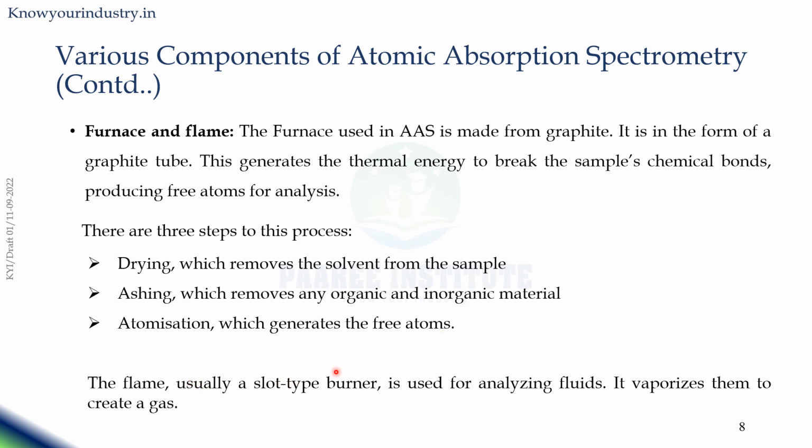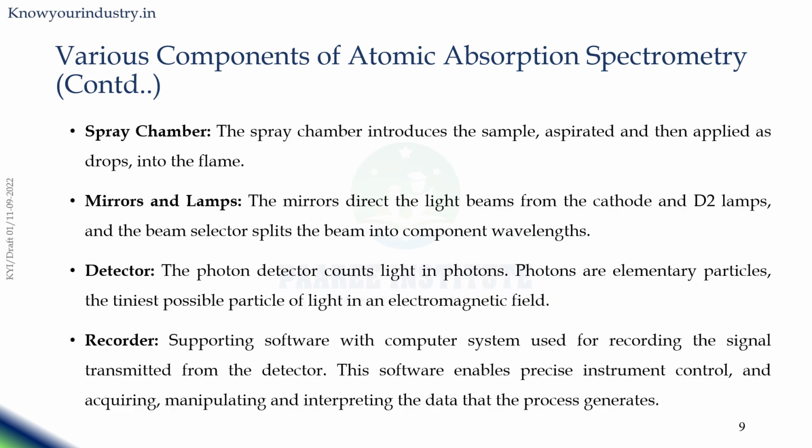The flame, usually a slot type burner, is used for analyzing fluids. It vaporizes them to create a gas. Then it comes to the spray chamber. It introduces the sample, which is aspirated and then applied as drops into the flame.